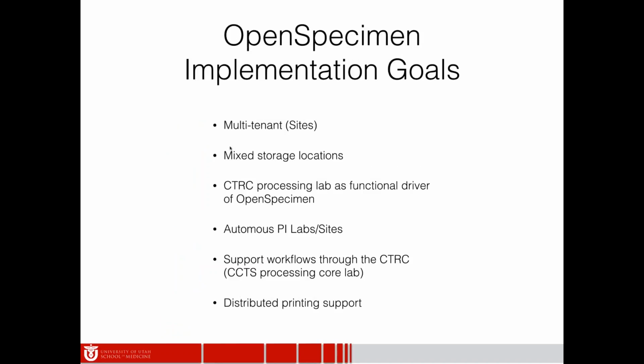So specific to OpenSpecimen, we have some implementation goals. One of them is that we would set this up in a multi-tenant environment. Most of our researchers operate sort of independently, and we're not going at this from a central biobanking point of view, although biobanking will be a functional part of this down the road. They also have mixed storage locations, so there are shared freezers that some centers or institutes within the Health Sciences Center run that PIs use.